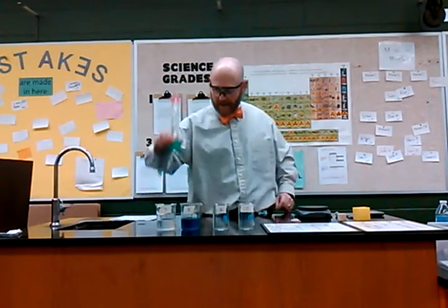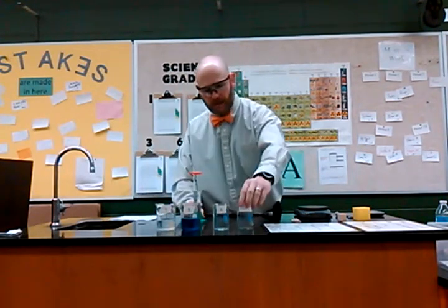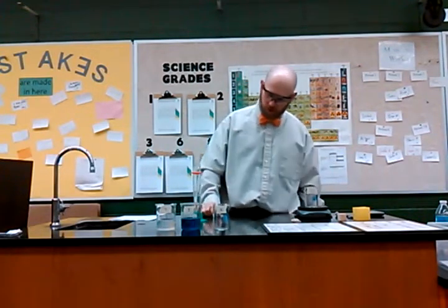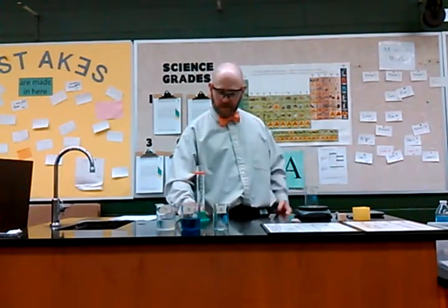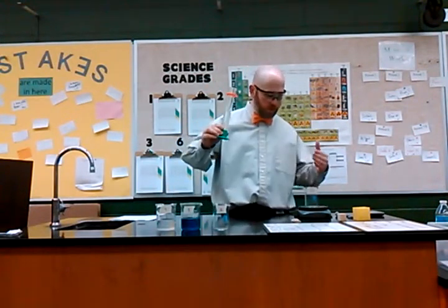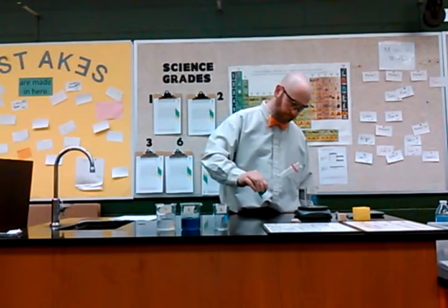So I have that in here, and I will take beaker 1 in this step and place it on the scale, and that is 66, and I will add 70 milliliters to the beaker.